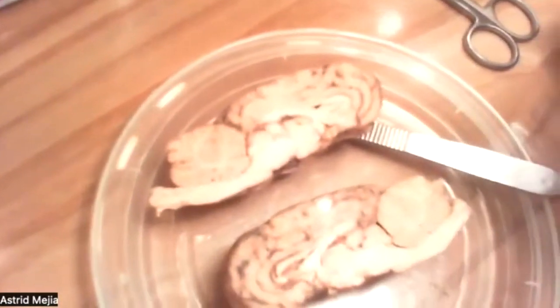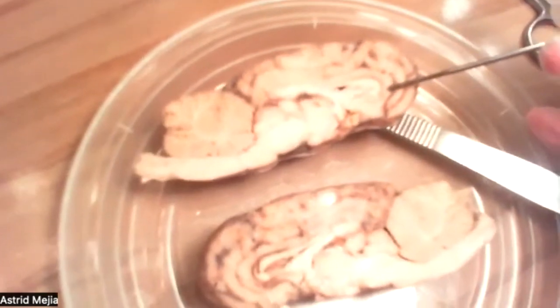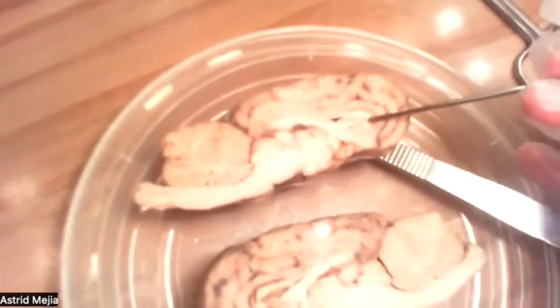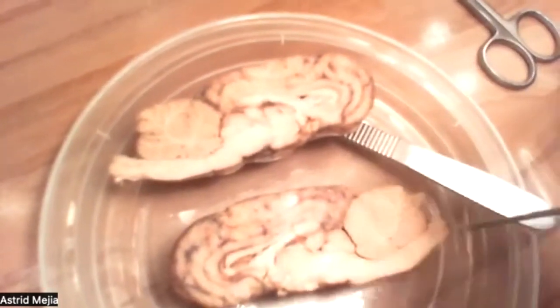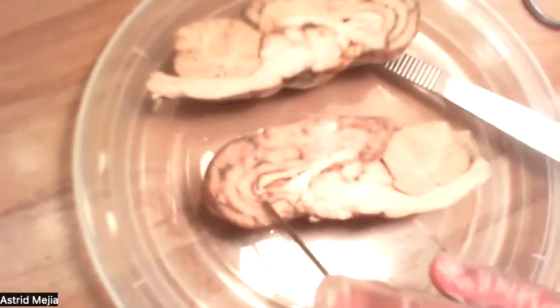Oh, the gyrus. I forgot about the gyrus. So the gyrus is located right here. It will be right there. And the gyrus increases the surface area of the cerebral cortex and forms brain divisions. The gyrus would be right there.